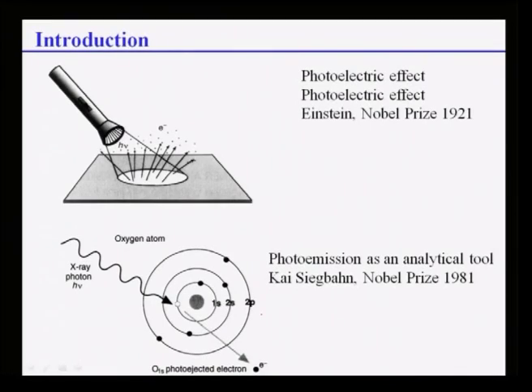That is what is shown in the first slide. You see there is a light source with photon quanta of energy h nu, and this can eject electrons from the photoactive elements, and that can produce electricity.